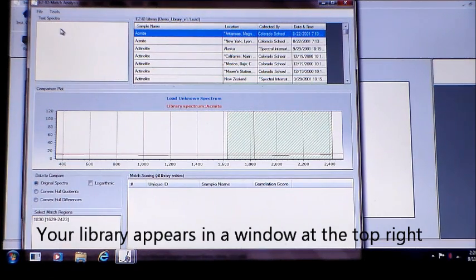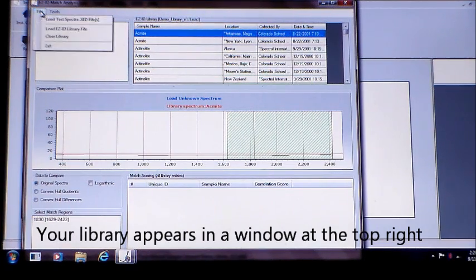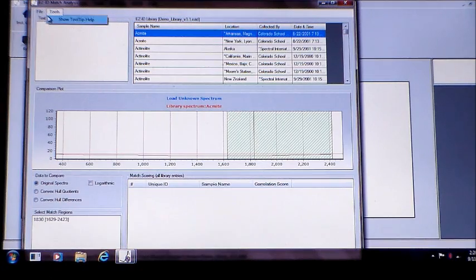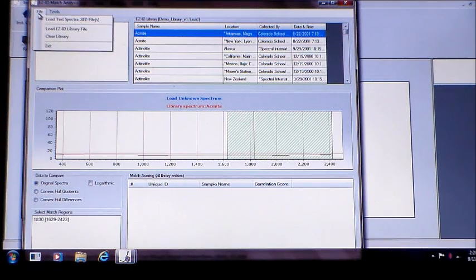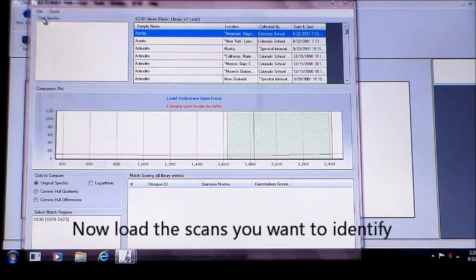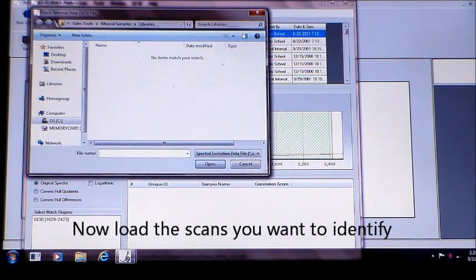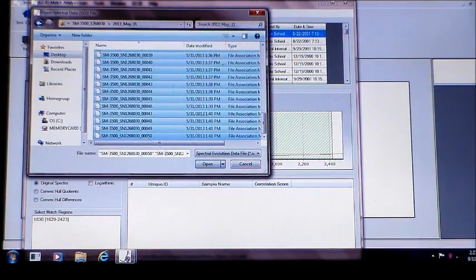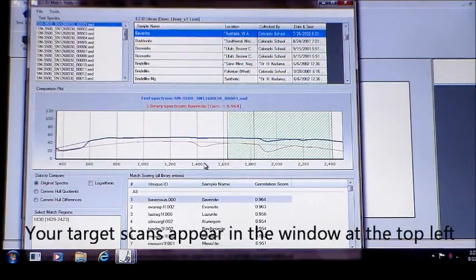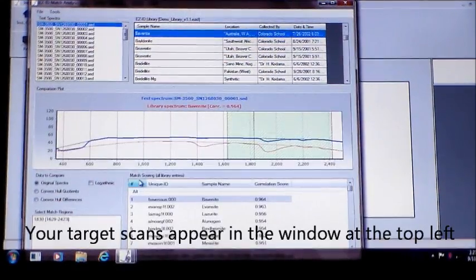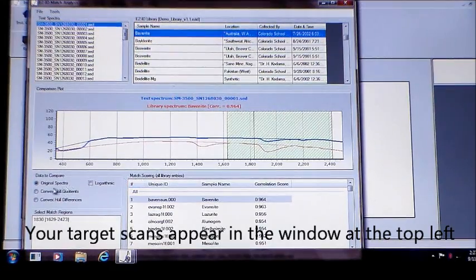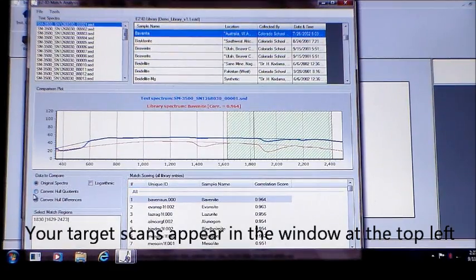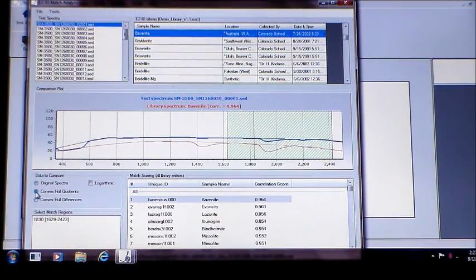Now select the target scans you want to compare to your library. The scan files will appear at the top left, next to your library.